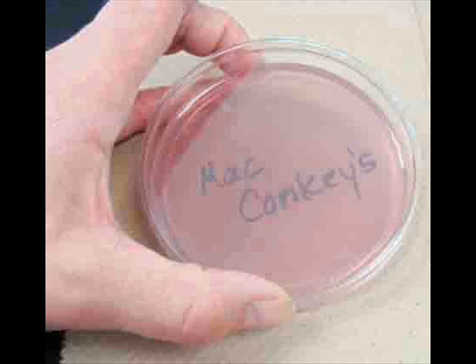This video is about MacConkey's agar, a specialized bacterial growth medium. This piece provides photos and interpretations of various types of bacterial growth on MacConkey's.